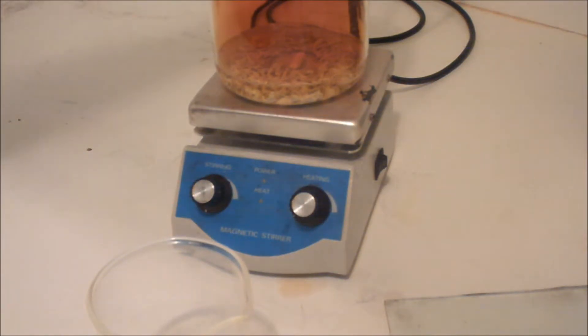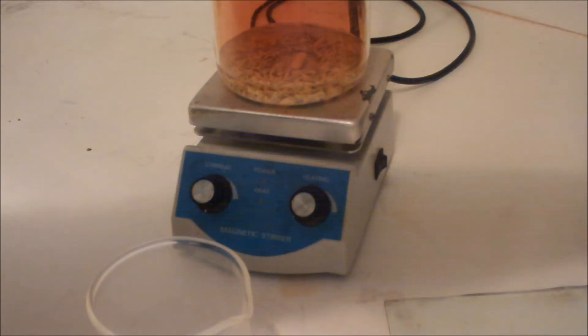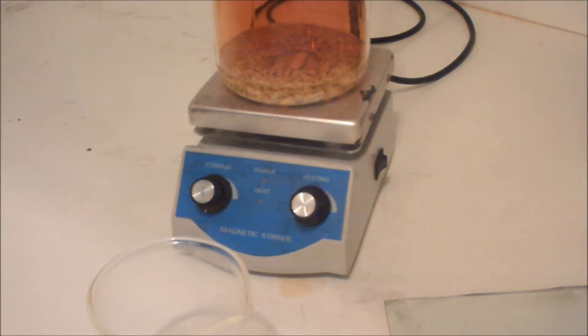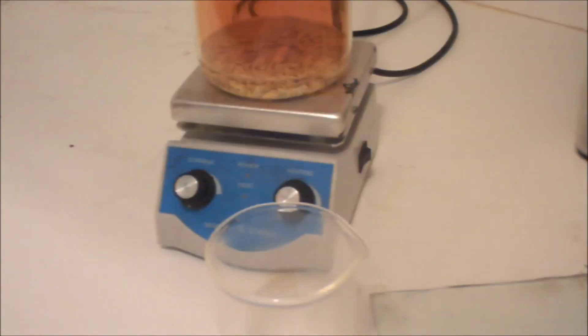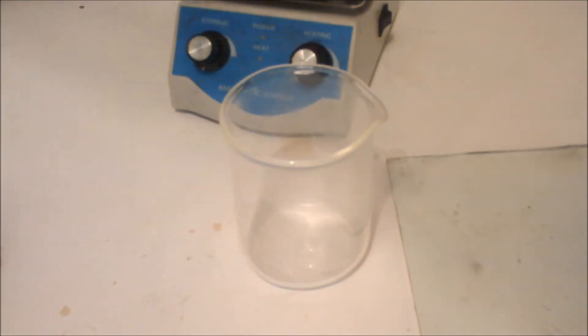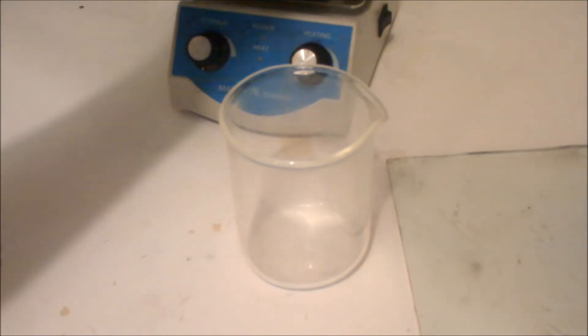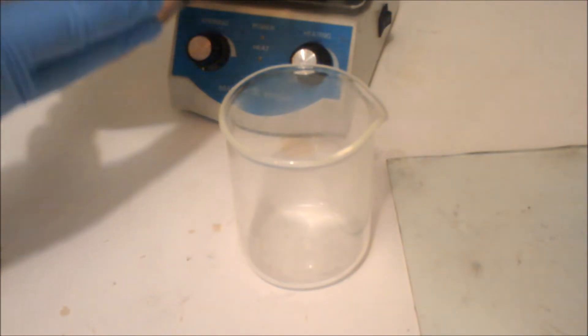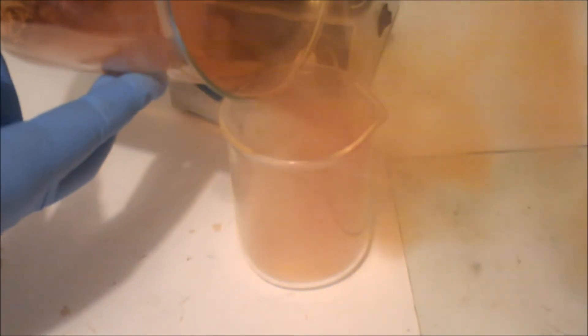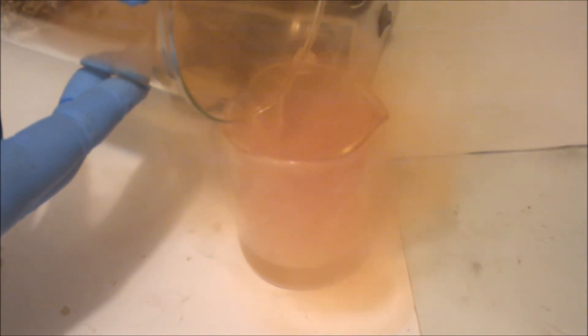I'm going to take off this round bottom flask and put it to the side. I'm going to pour the nitric acid and lead nitrate solution into this beaker while it's still hot.